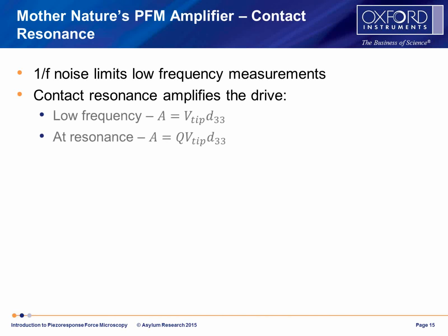So this expression is valid only identically at resonance, but it's an approximation near resonance. Basically the cantilever response is multiplied by whatever that Q factor is. Typical Q factors, I think I may have mentioned at some point, are 20 to 100, maybe 200, and so you get an improvement in your signal to noise of anywhere from 20 to 200.